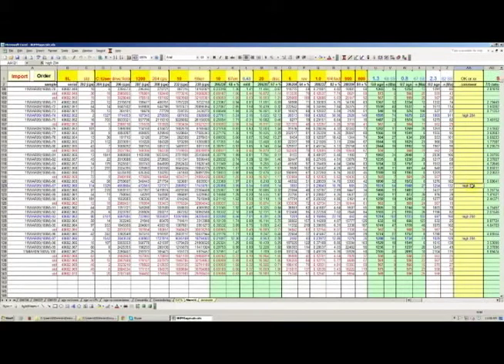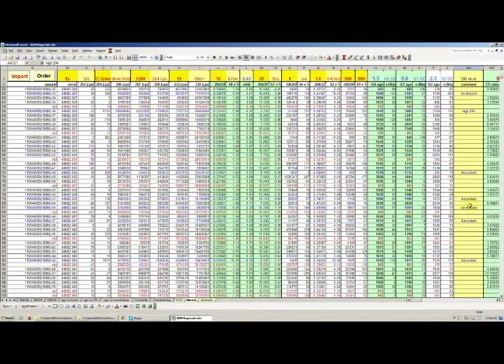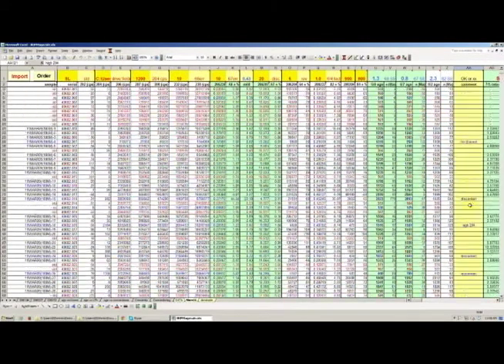A few more are being discarded because of this high 204. I'm just not going to go above that new threshold of 1200 counts per second. And actually, none of these samples are being rejected because of the maximum uncertainty thresholds that we set for the 6-8 age or 6-7 age, and that's good news. That means that all analyses are more precise than 10%.